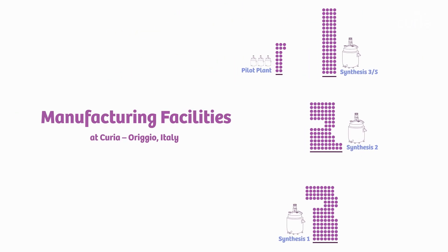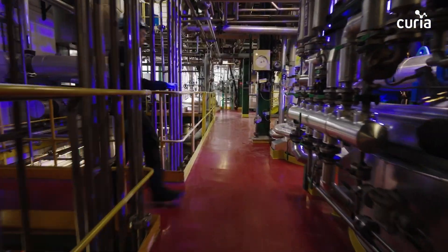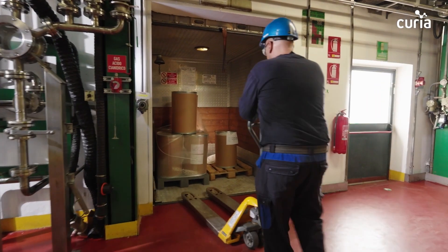In the core manufacturing facilities, batches are initiated when operators charge raw materials into reactors manually and via pipeline.